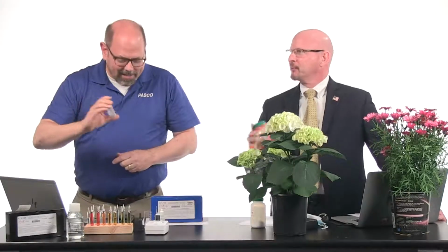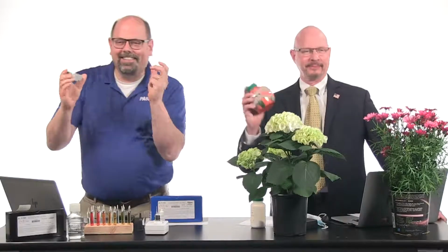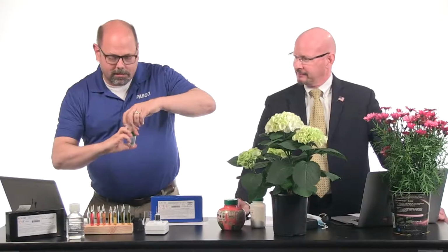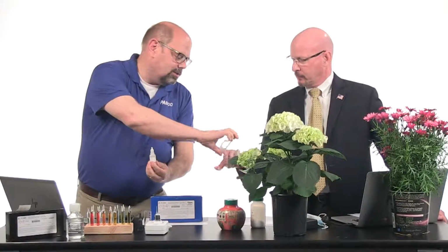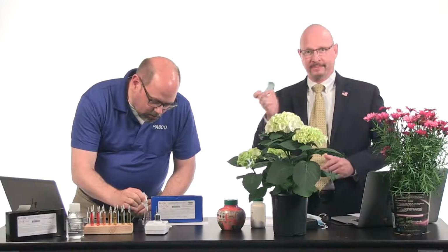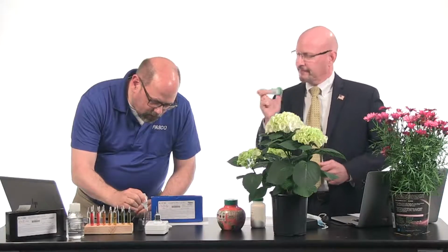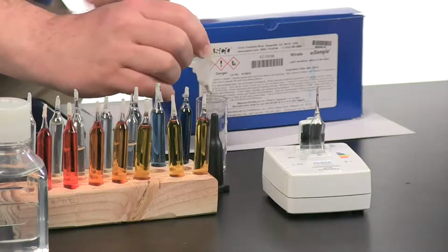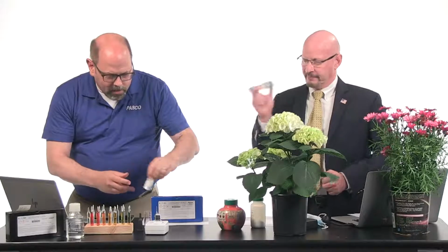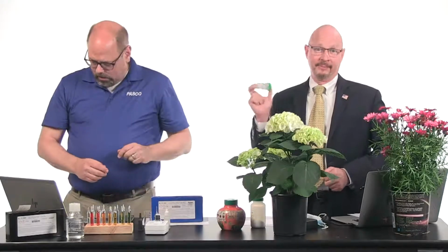And again, read the directions because I'm just going off the top of my head. I mean, I've done lots of these. So I can join you in that. We can do a little shaking here as we're going. While we're doing that, I'm going to put the couple of drops of the acid that fixes this into, here, I can give that to you so you can keep shaking that. And again, those directions are included in the packet.